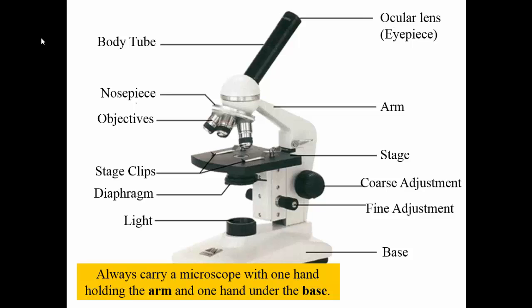It's not going to be necessary for us to use that fourth objective lens. So for the most part, we're going to stick with the low power, medium power, and high power objective lenses. You'll also see on this microscope that there are stage clips. It is not always necessary to utilize stage clips, and some stage clips might not look exactly as they do on this particular microscope. But this is a good basic representation of the parts of the microscope.